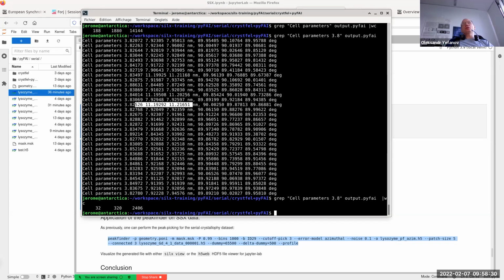Don't hesitate to contact him, or you can also contact me because, well, I'm doing CrystFEL for my living. Until last week, we were considering presenting only the sparsification part, but because we managed to get something more or less running.